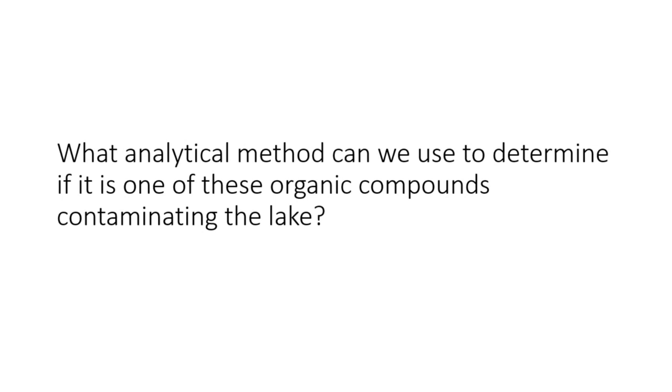Yeah, Alyssa's on the ball. Some people call it high pressure liquid chromatography. If you see it in the book, it's the same thing, but we normally just call it high performance liquid chromatography. So I'm going to pass it over to Kat now, who's actually going to do a demonstration of the HPLC machine. Take it away, Kat, if you're ready.